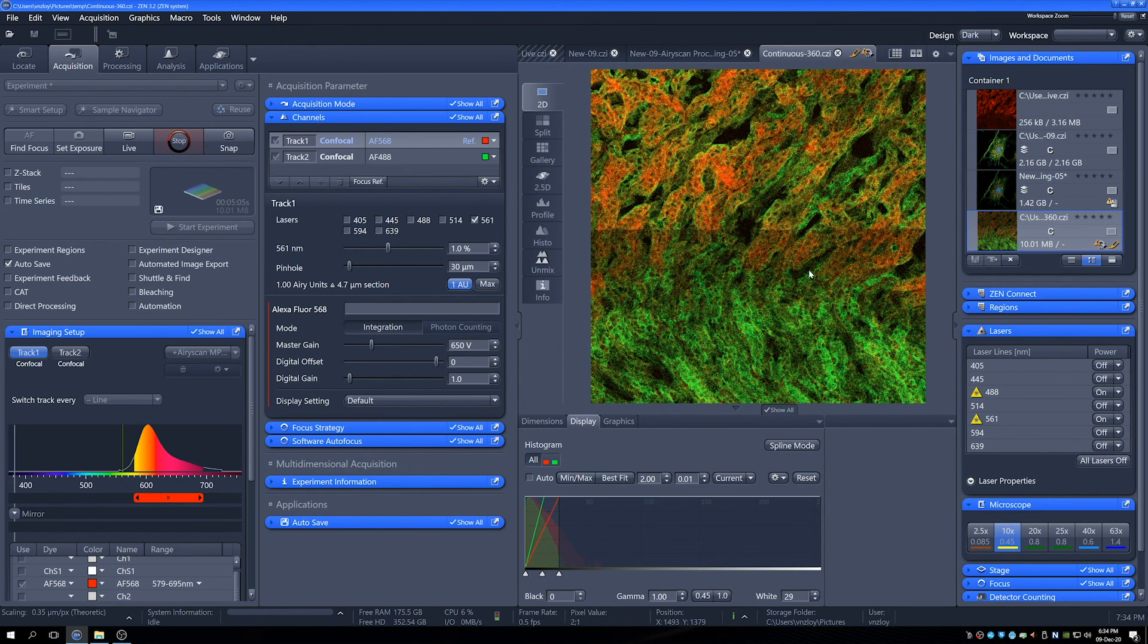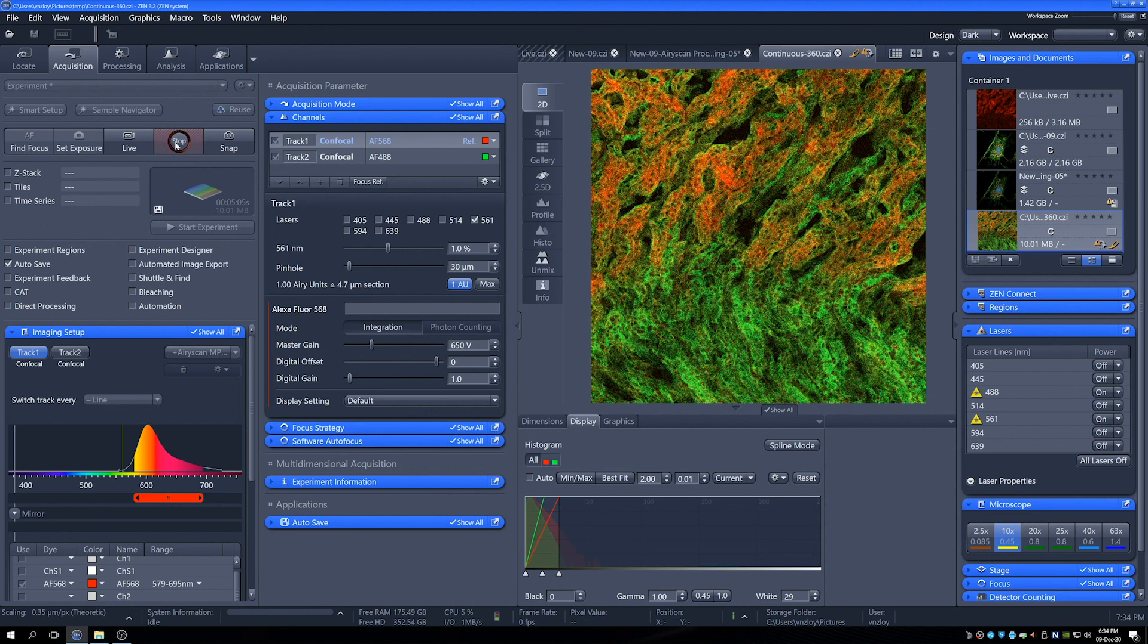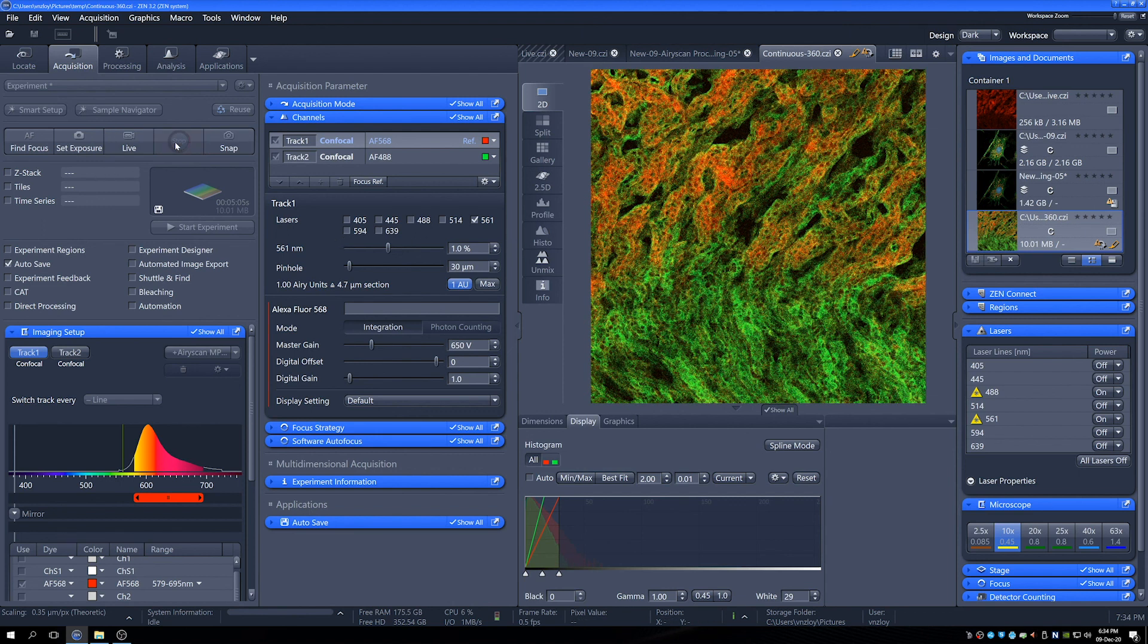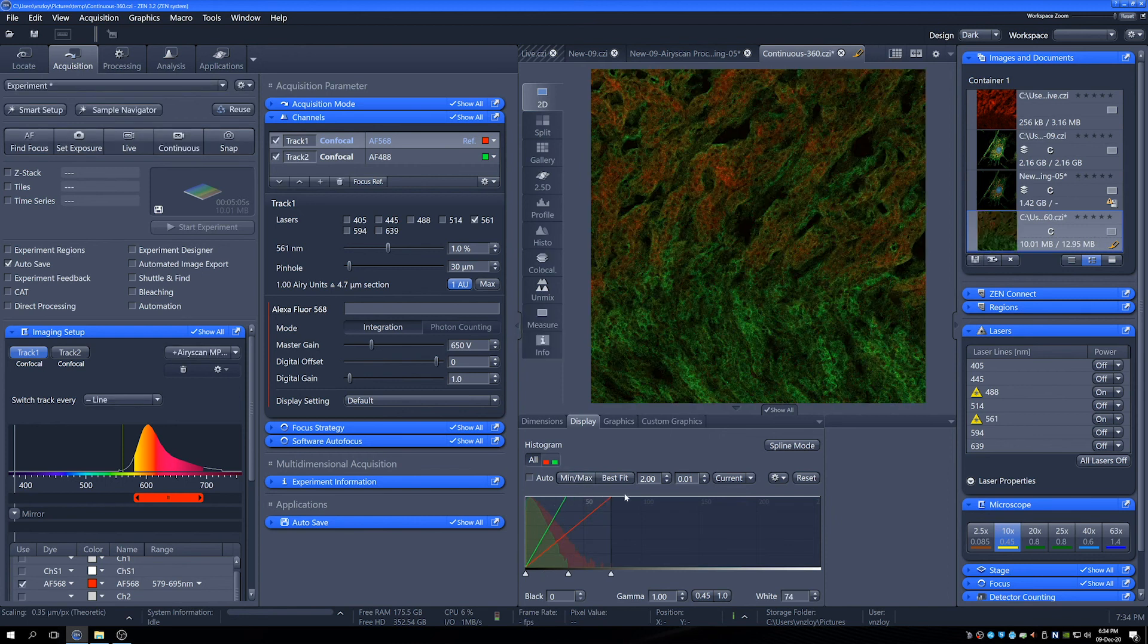And there we go. We've got quite a nice focus plane there with a lot of detail in these kidney cells. Lovely. We'll just min-max that so it's not quite so saturated.